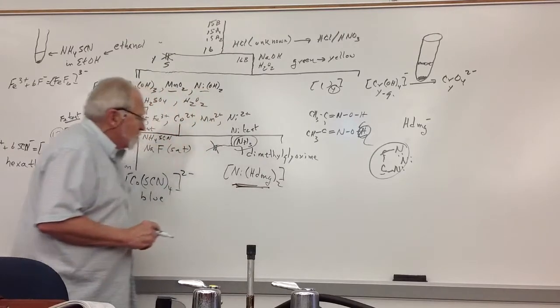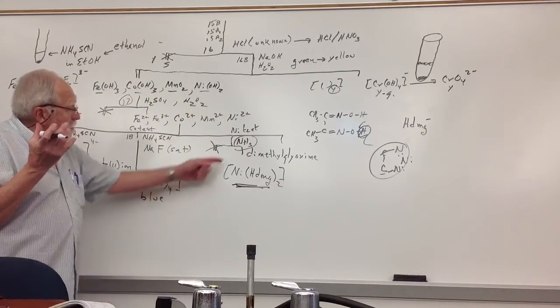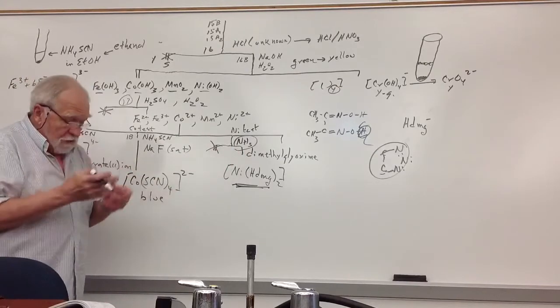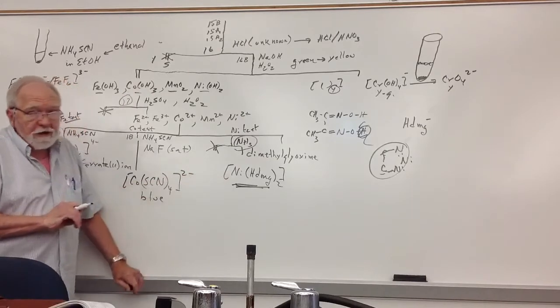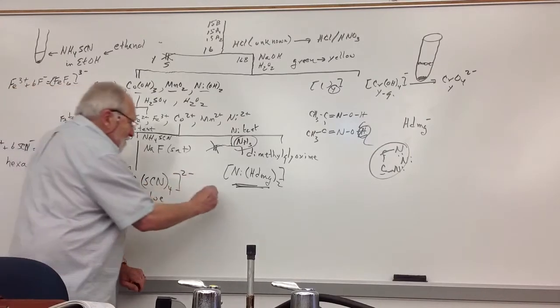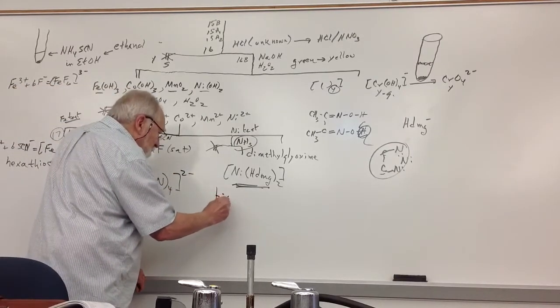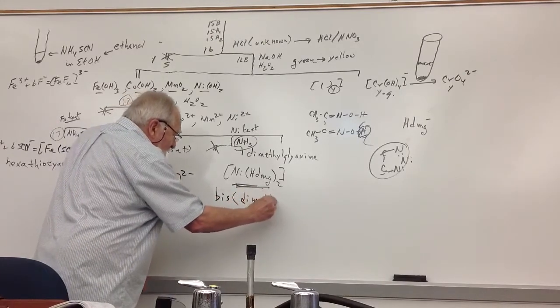I'll underline it. It's a precipitate. Again, you can get some impurities that will give you a red color with the solution with the dimethylglyoxime, but only nickel will give you the precipitate. You have to get a precipitate. And what's the name of that precipitate? Remember good old this? I think we named this a long time ago.